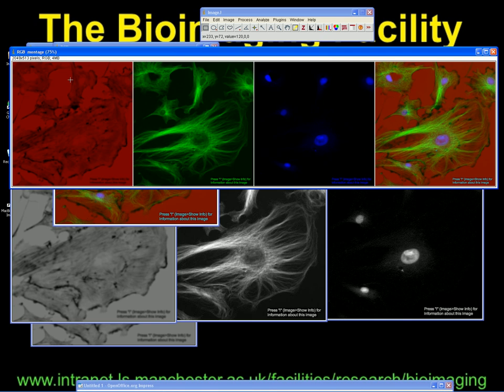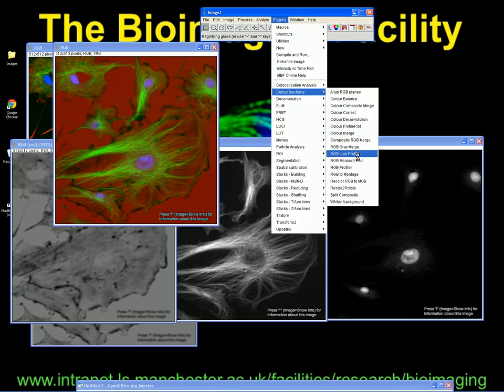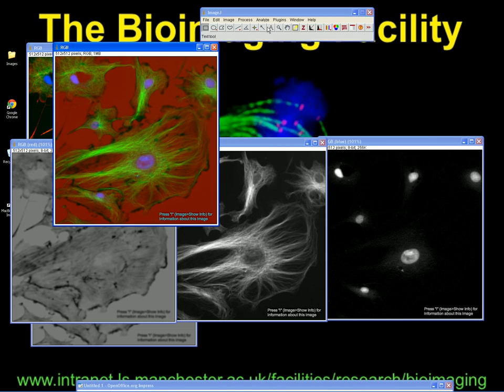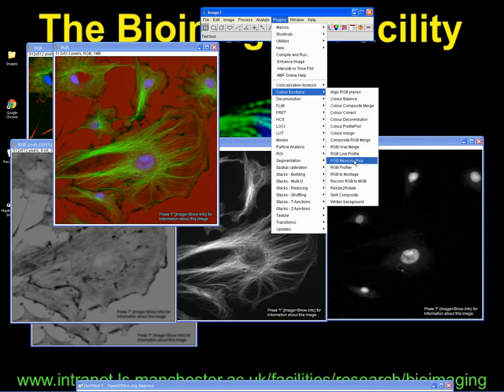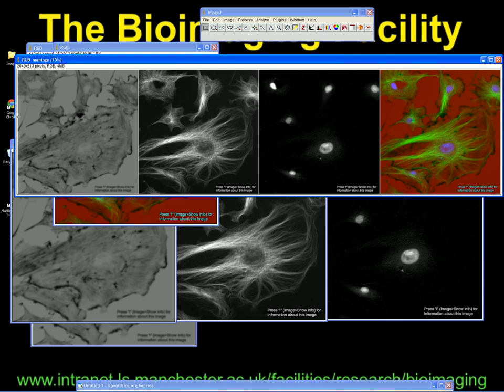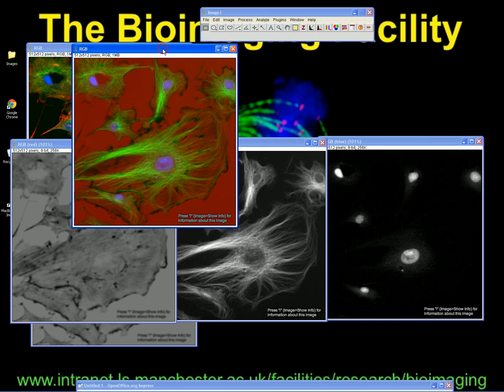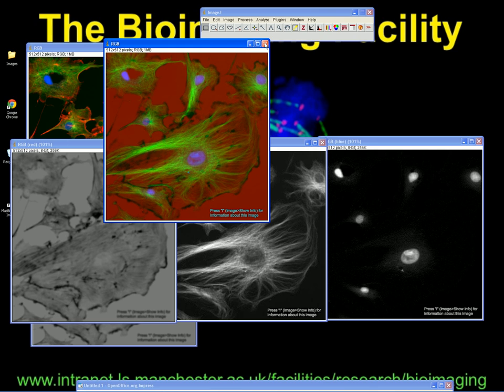We always get it attempting to split it into a red, green, and blue, and then a merged image. If we tried it the other way using grayscale — RGB to Montage, this time in grays — the phase is right, but we wanted to show these in colour, and still the merged image at the end looks completely wrong. So we can't use this RGB to Montage tool. It is effectively useless here.